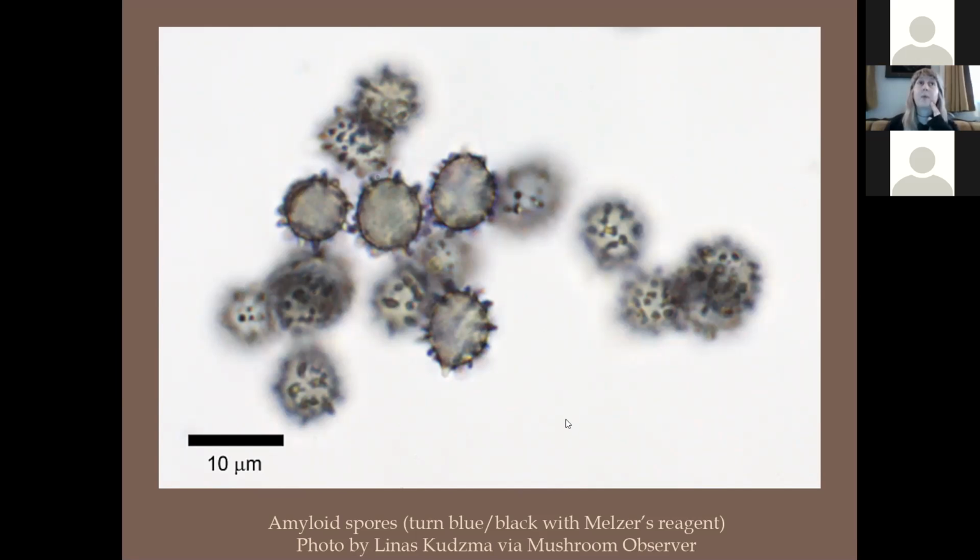I would think that water would be good to not kill it, but you're working with such a tiny amount of material when you have this slide. I mean, you don't undo the cover slip and then take the spore out and put it outside or whatever. Usually you just throw the slides away when you're done or wash them. So I don't know, that's not something I've really thought about before.